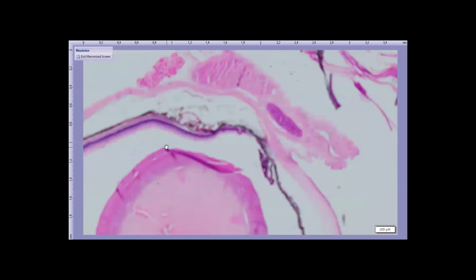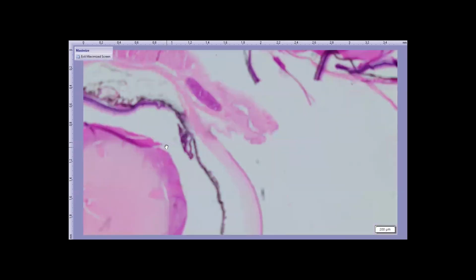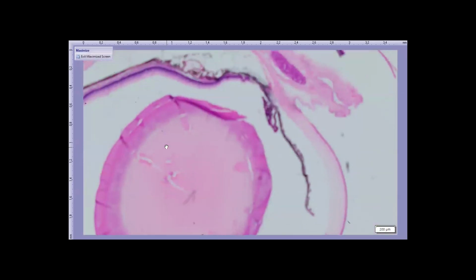And I don't think we have an optic nerve in this opossum. I think we have a better section. Yeah, here's a better section. Unfortunately, we don't have an optic nerve. So again, it's a classical nocturnal eye with a big wraparound cornea, a more centrally positioned round lens. The only thing we're really interested in here is the tapetum.